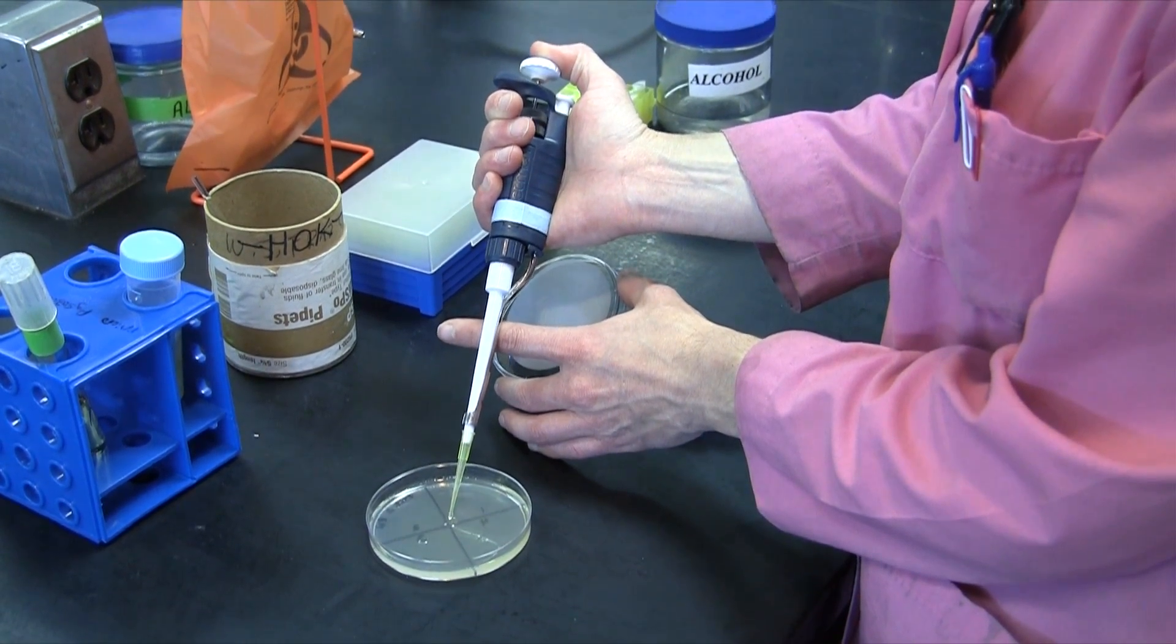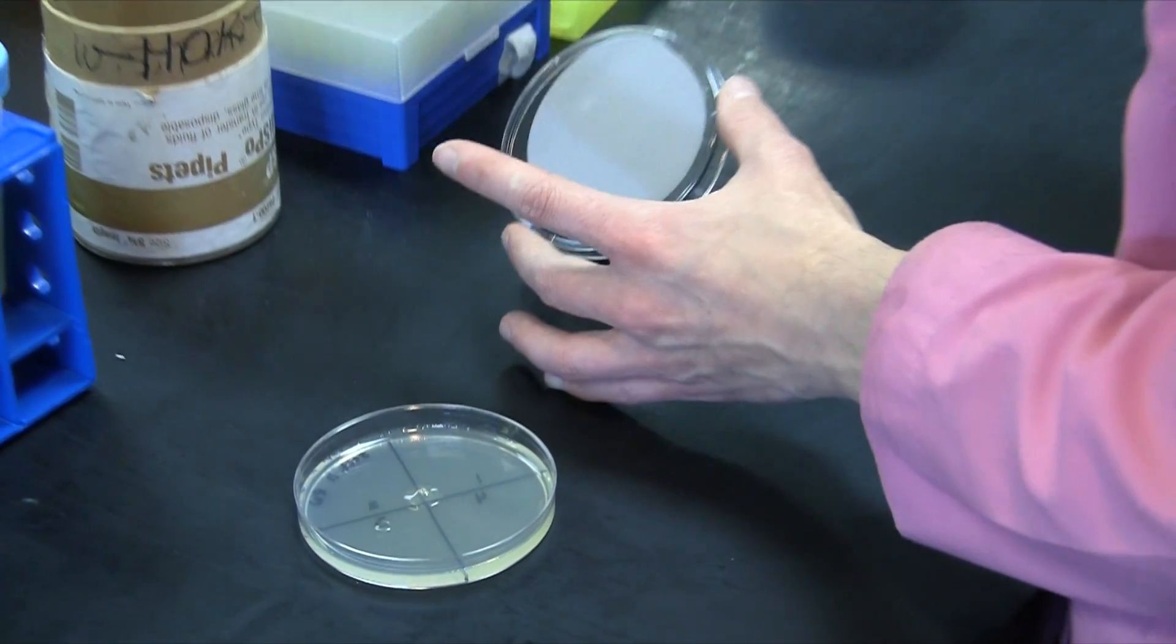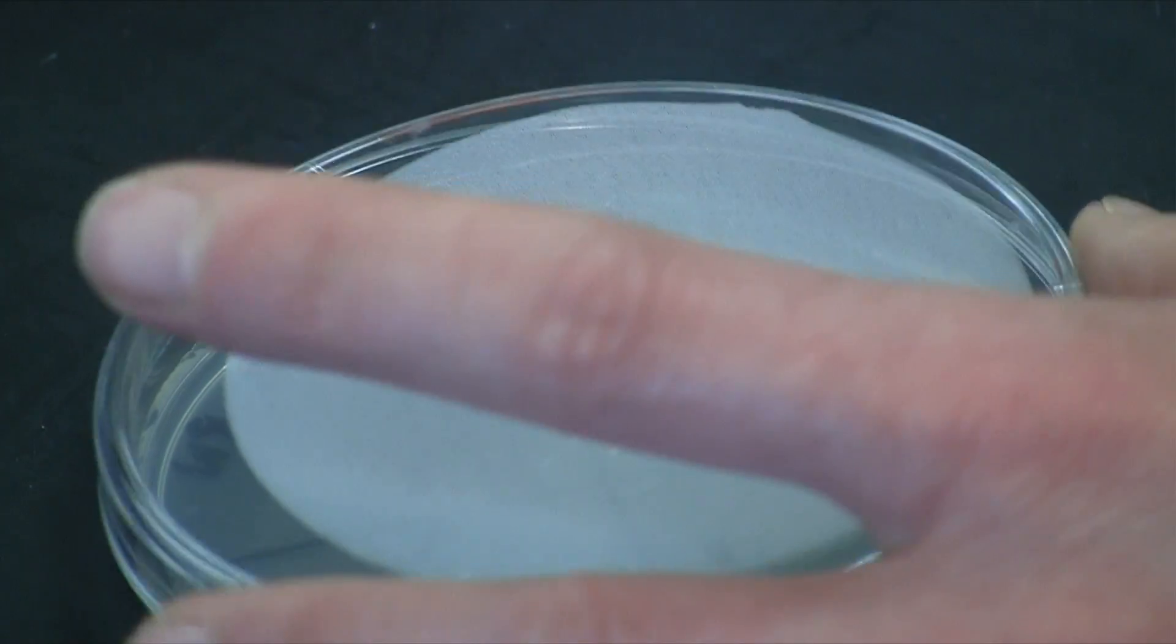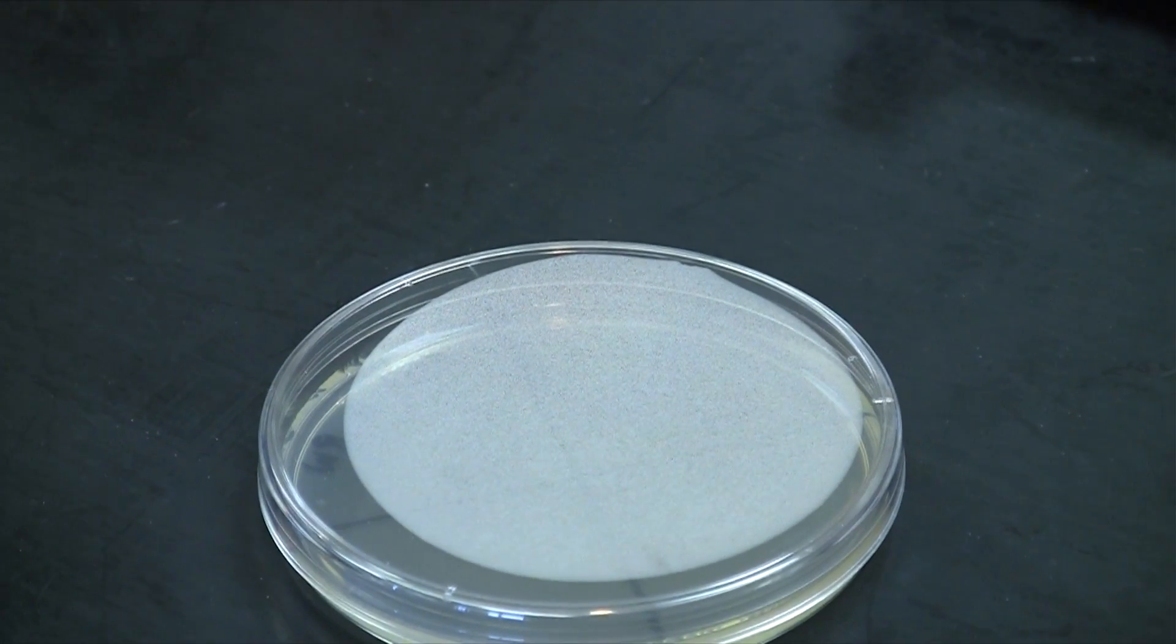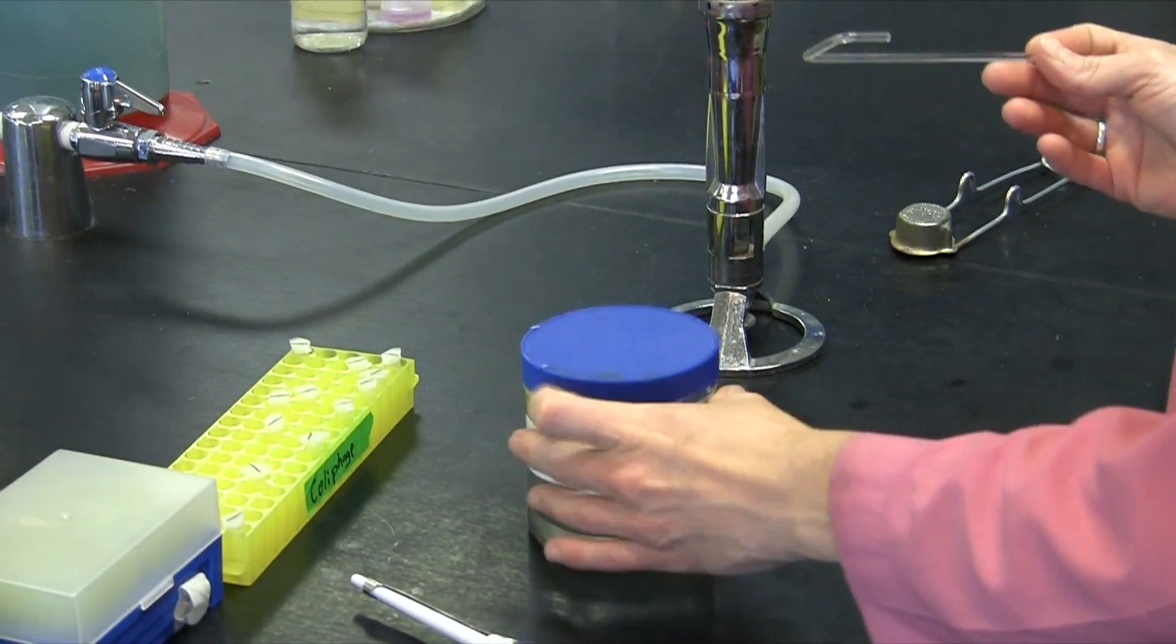Go ahead and spot your bacteria onto the center of the plate, because we're going to be using the spread bar to disperse them throughout the entire plate. You will have already labeled your plate with four quadrants. Three of these quadrants are going to be spotted with bacteriophage, and one of them will be our control.